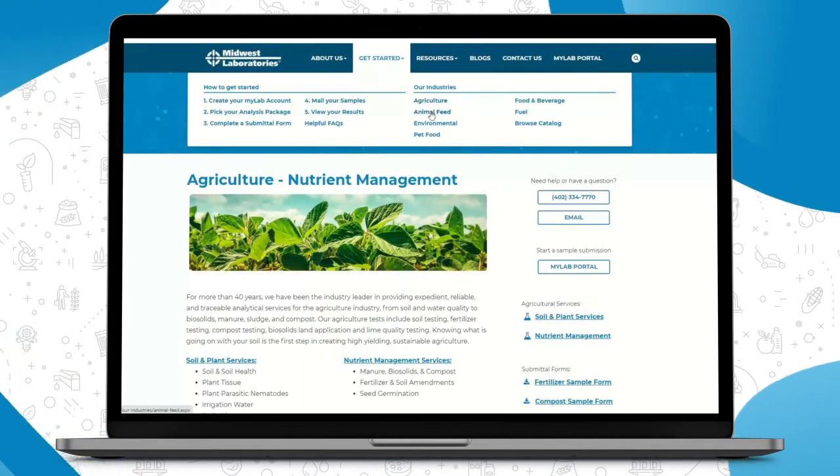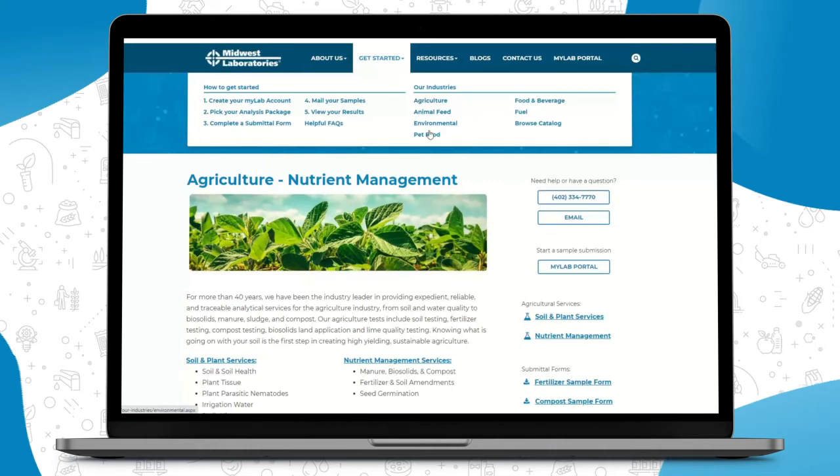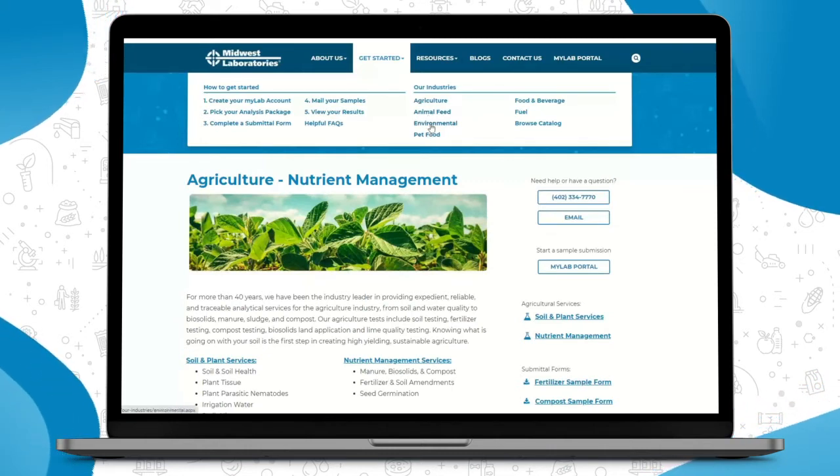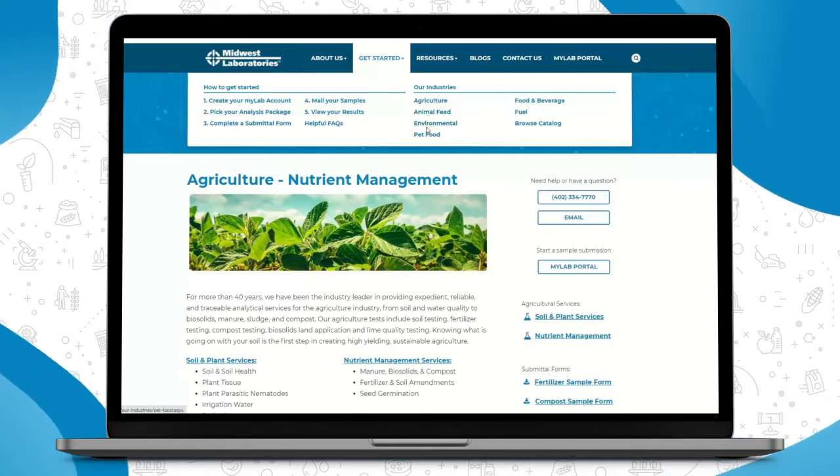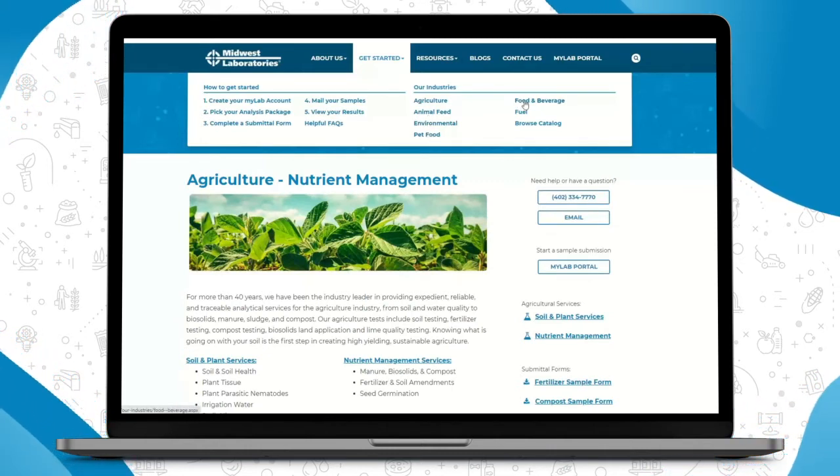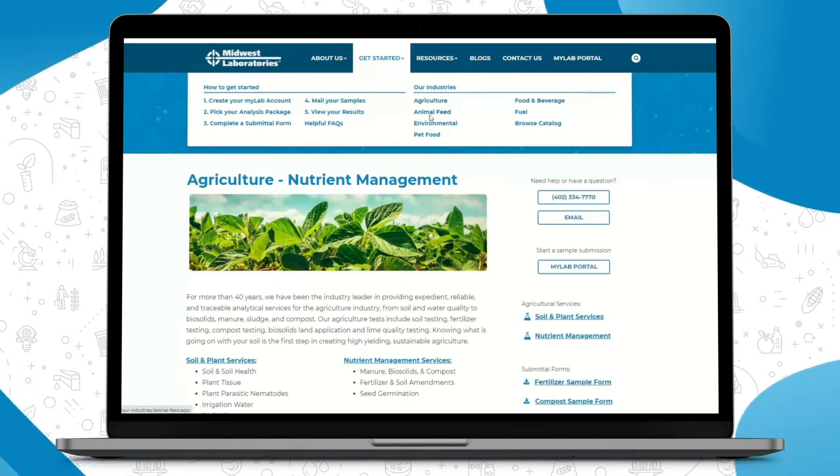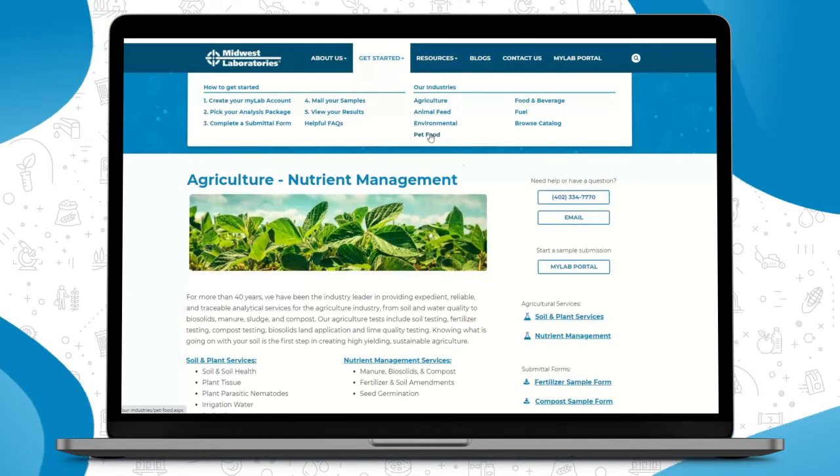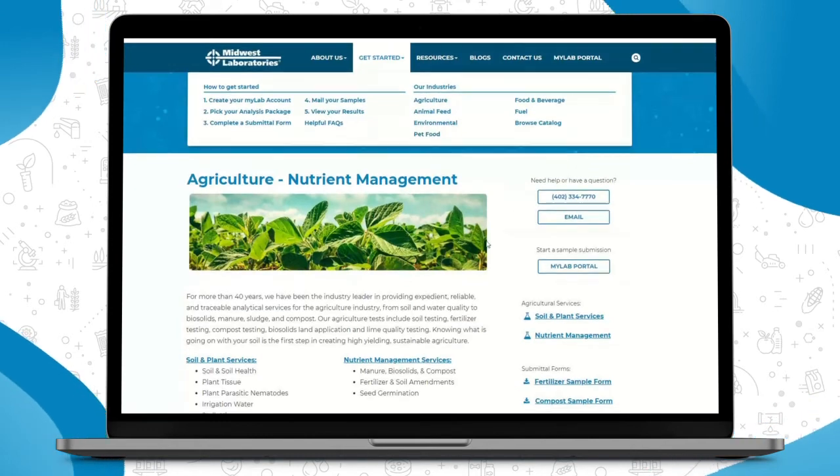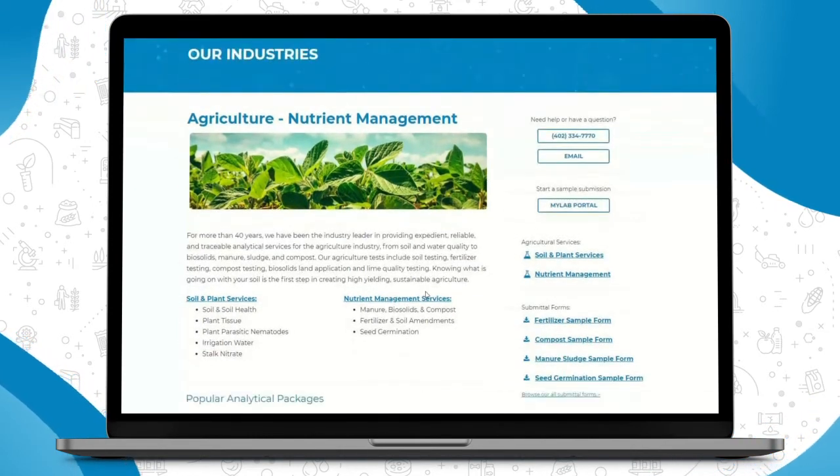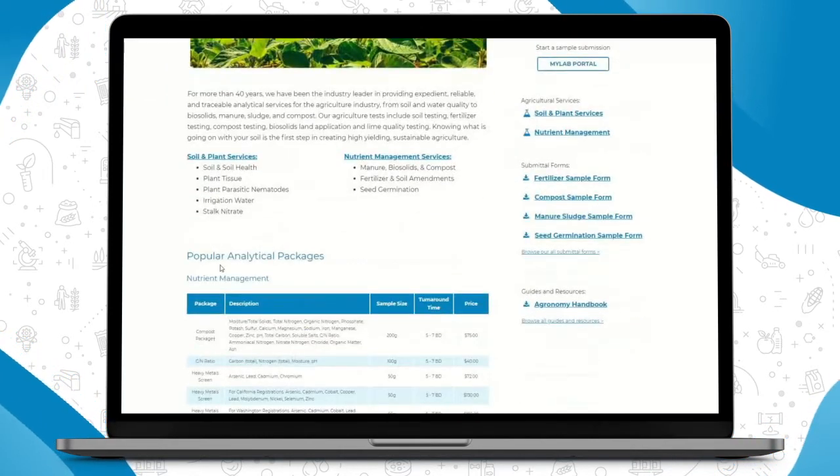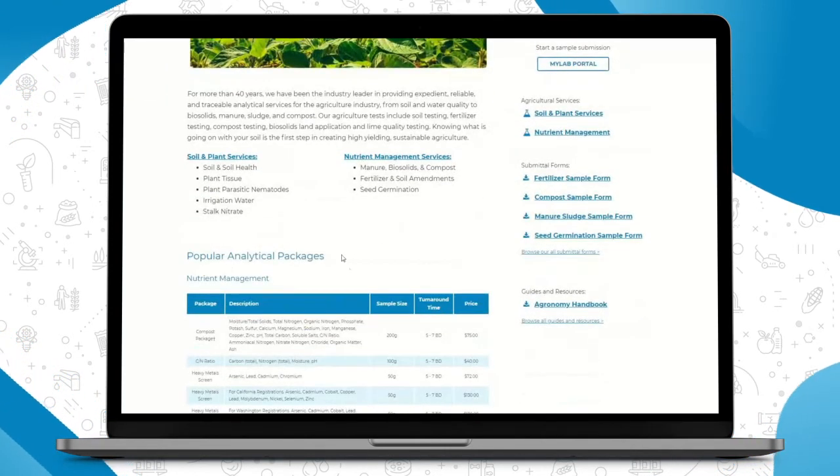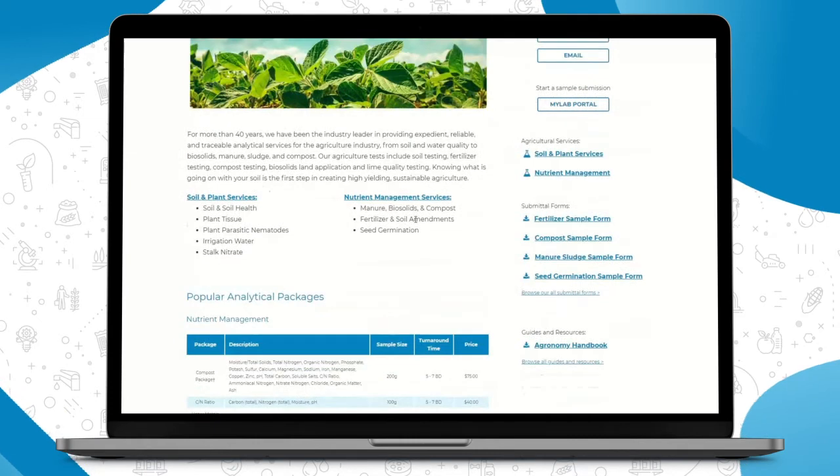So you can do this by any industry. So if you're sending in an animal feed sample, a water sample for environmental, pet food, food and beverage, or fuel, each of these pages is where you'll find the most information for your industry, as well as helpful documentation and our most popular analytical packages.